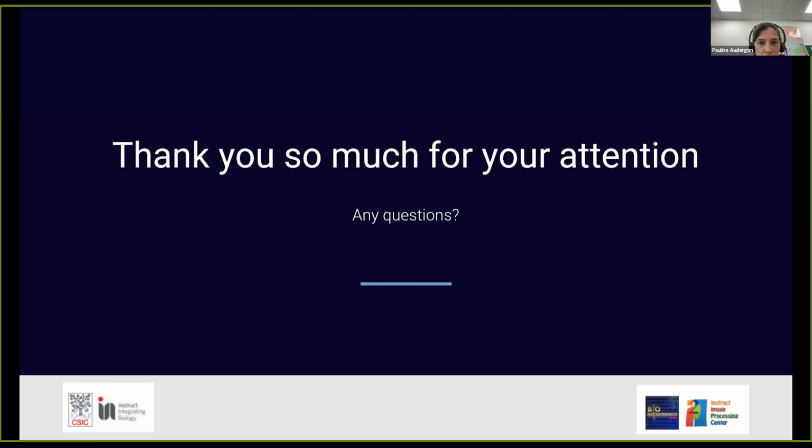Okay, and we have a second question. What requirements does Flexibility Hub need? For example, a large box, about 512 pixel size particle. Sorry, I do not understand well how the consensus works. Is there a way to validate which of the different approaches or solutions are better? Are they weighted or is an error calculated?